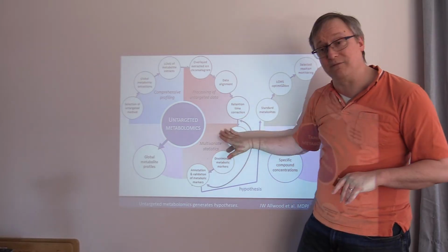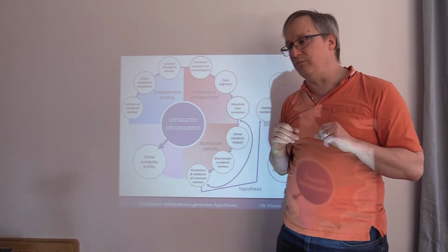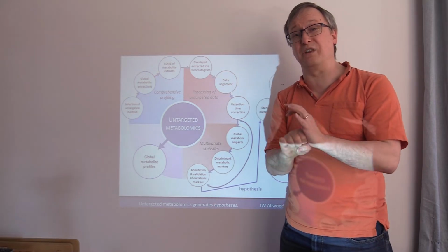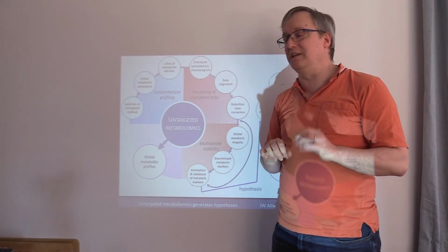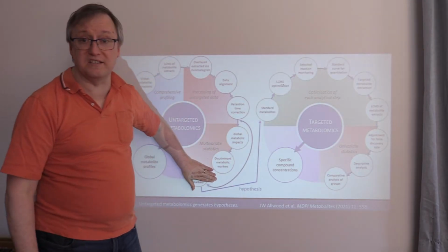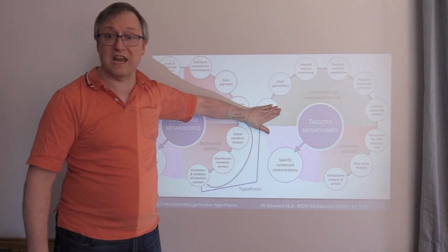And finally, we have some fairly complex multivariate statistics that allow us to put together a list of metabolites we think are particularly associated with our phenotype. In the clinical biomarker space, you would say these are our putative biomarkers. Now, the information from this untargeted experiment is then transmitted to this next round.